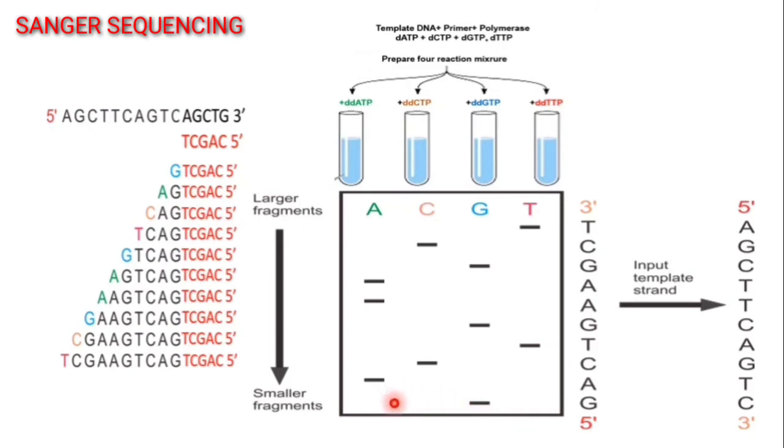After running the gel, we expose it for autoradiography, and in that autoradiography film we will find the bands.